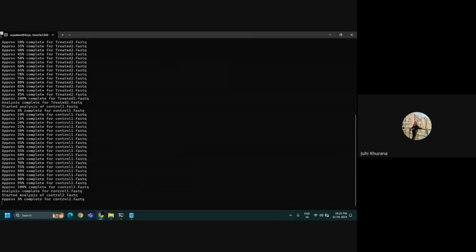Okay. I have two doubts. You told us that you usually prefer the ENA database, right? So why is it so? Okay, so you can run this on the terminal. Meanwhile, I will tell you why ENA. Let me share my screen.